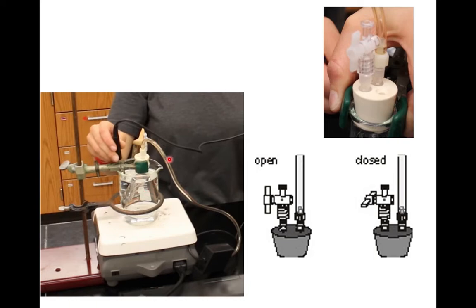Also, I want to point out for this lab, you are going to start the lab with heating the gas, and you're going to keep the valve open. It's a sort of chemistry rule of thumb and law that we follow, that you don't heat a closed system, because that closed system can explode if the pressure gets too high. Here, really what you would end up doing most likely is popping this off. But we want to get you started following the rules in the right sort of way here. You don't want to heat a closed system. And so while you're doing the heating, this valve is going to remain open. When you get to the point where it is up to the temperature that you want it to be, you're going to close the valve, and then the valve is going to stay closed as you collect all of your low temperature data.